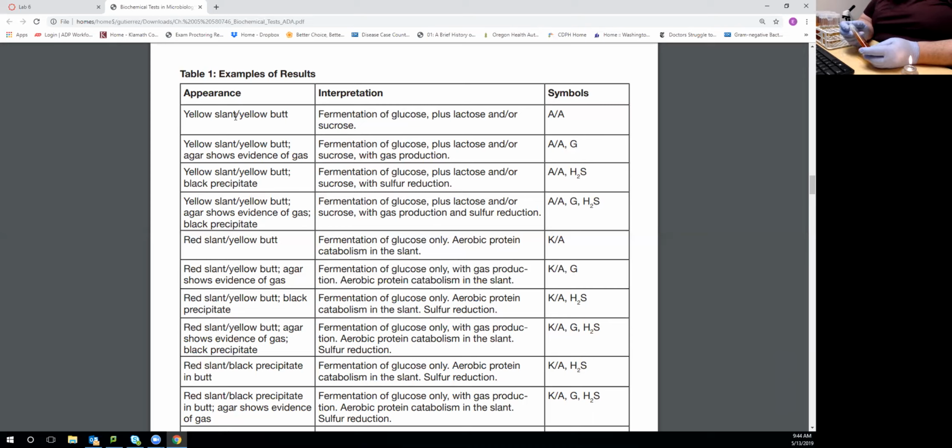So that would be a great place to put these, because we're trying to reach 37 degrees centigrade or 98.6 degrees Fahrenheit. In other words, the same temperature that our bodies have, okay? And if you reach that temperature, then these things will develop in a day. They'll develop overnight. And then you guys don't have to wait 2, 3, 4 days at room temperature, because that's really slowing everybody down terribly. That's a big hiccup that I finally figured out.